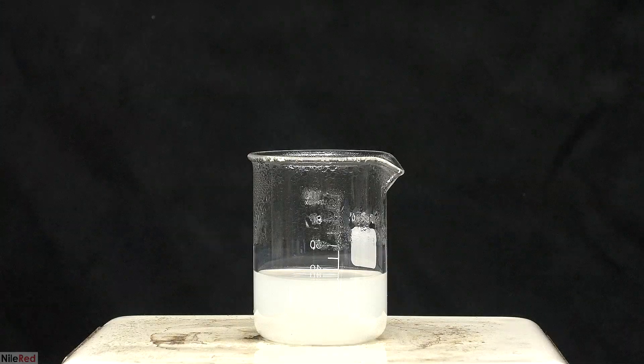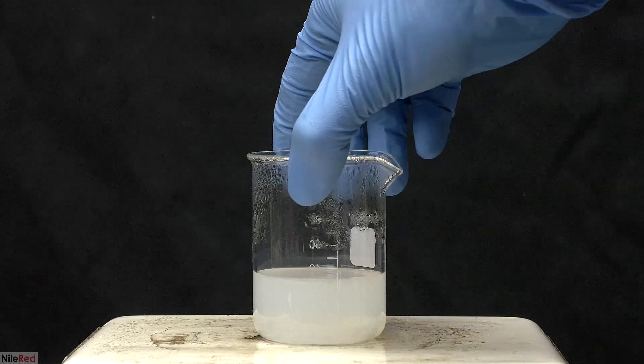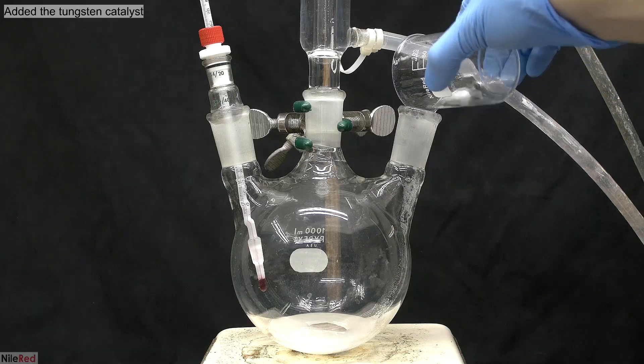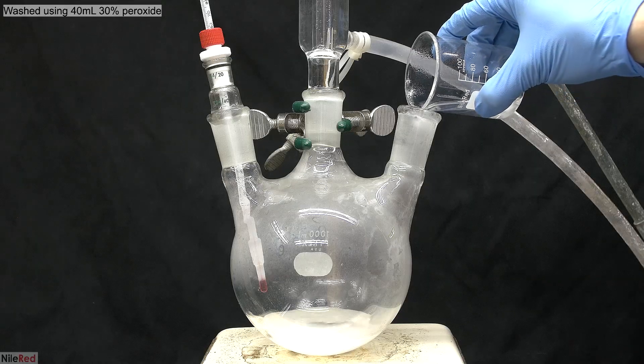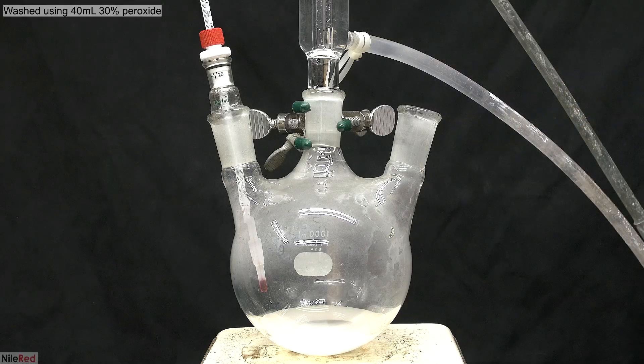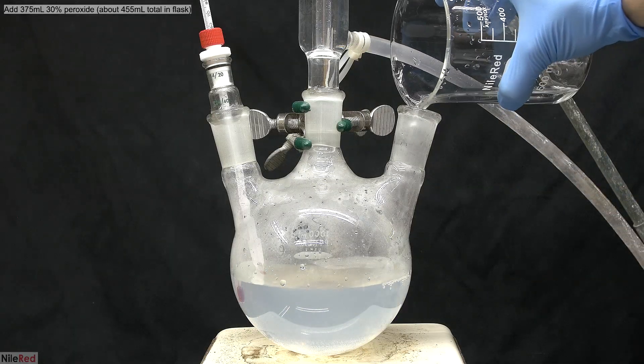The reaction is done when it doesn't look like there's any tungsten left. My solution here is murky, and in theory it should be perfectly clear, but I think my tungsten metal wasn't very pure. I quickly set up the reaction flask, and I added the catalyst to it. I washed the beaker with a decent amount of hydrogen peroxide, and I transfer this to the flask as well. With the catalyst in the flask, I then top it off with a bunch more peroxide.